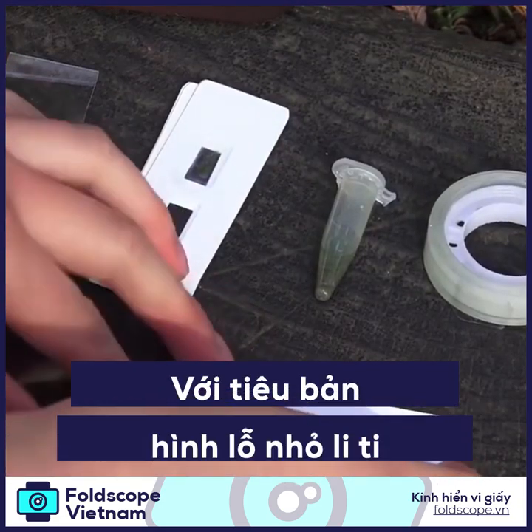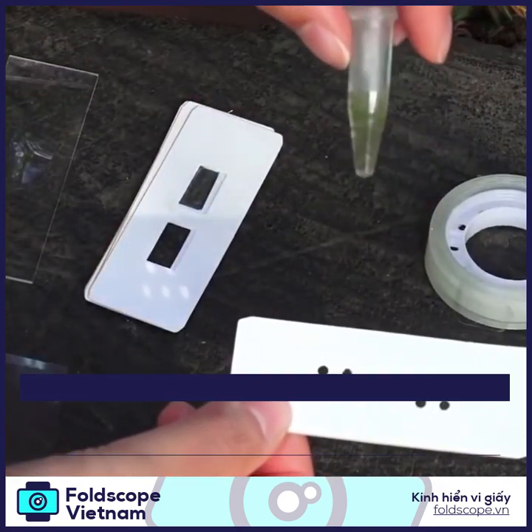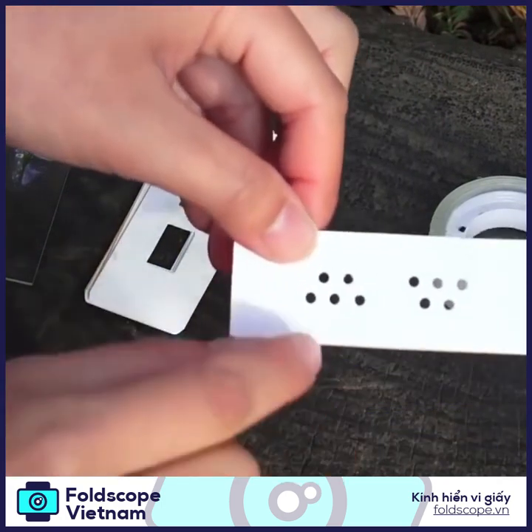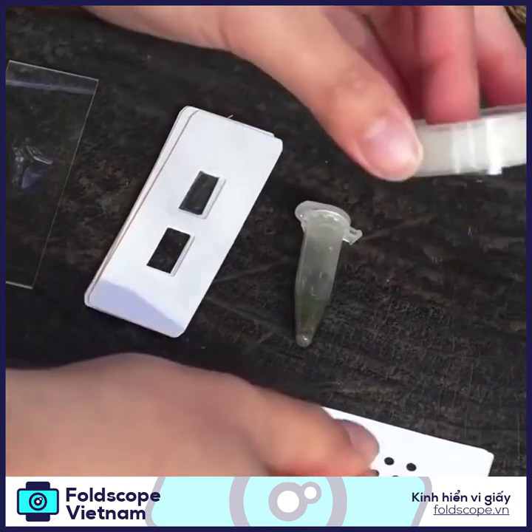Now let's practice preparing a sample with a micro well paper slide. These are great for pond water samples, which I have here. If there are any swimmers in here, they get trapped in these tiny wells so that you can see them clearly.